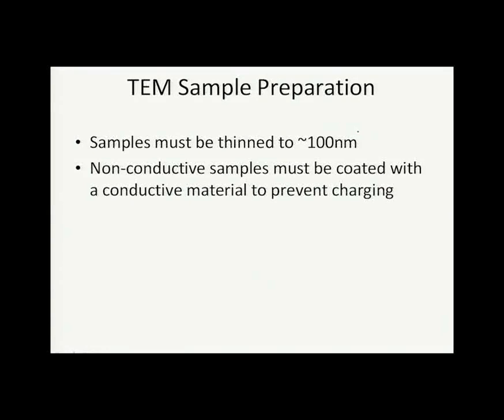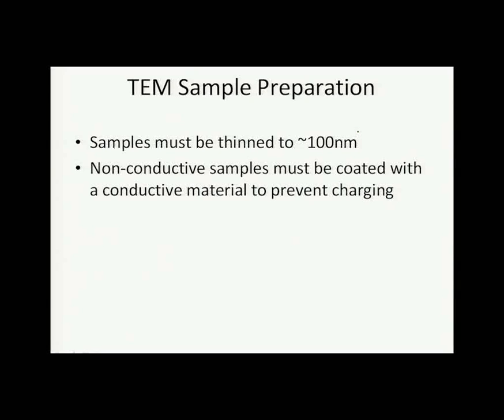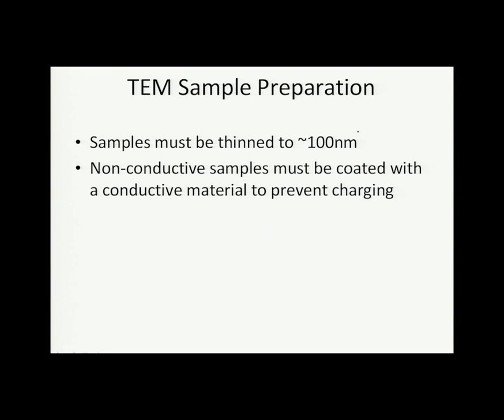As far as sample preparation for transmission electron microscopy, the samples must be very thin. Usually around 100 nanometers is a good thickness. Non-conductive samples must be coated with a conductive material to prevent charging.